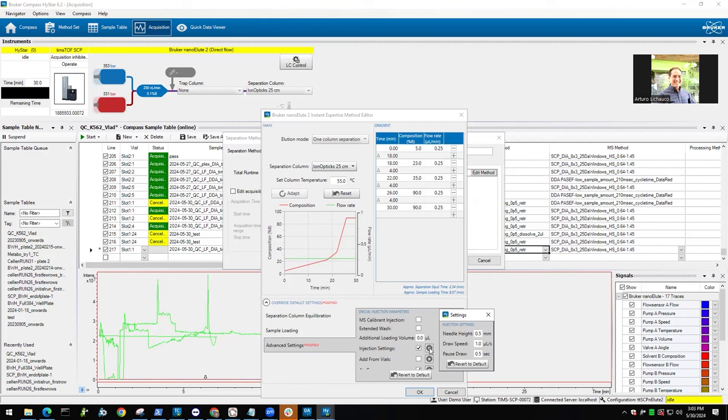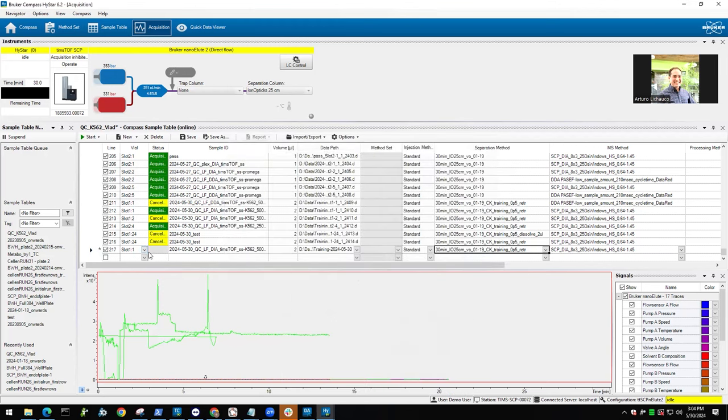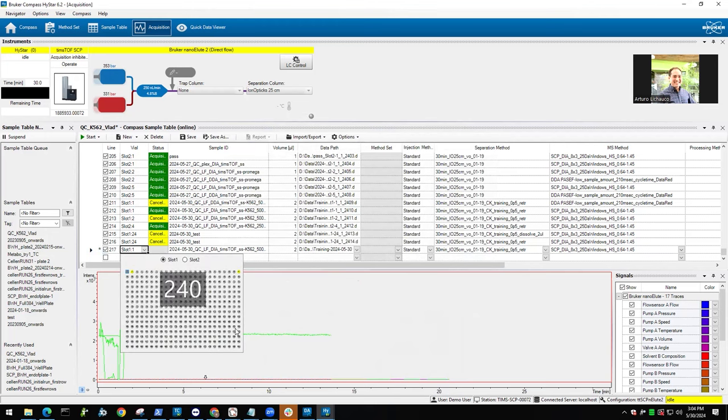Yeah. It should be fine with the default. The only thing is when you want to inject from plates and you want to inject everything, then you should change the needle height, the retraction. You can freely choose the wells, what you want to do. This is then done here. Basically, you have this drop down and you can choose whatever position and toggle between the two different positions.